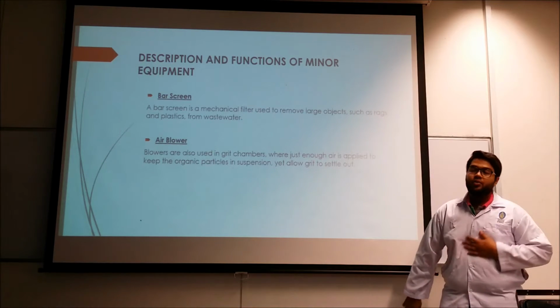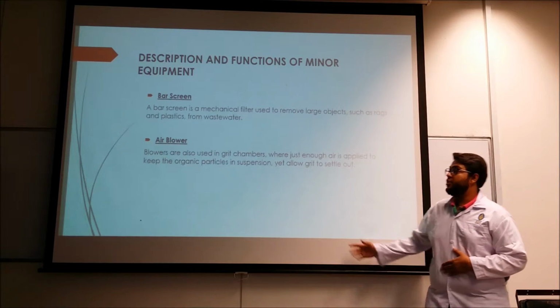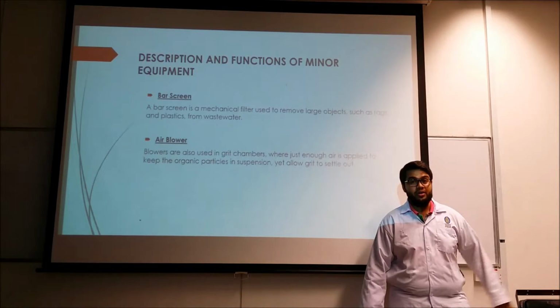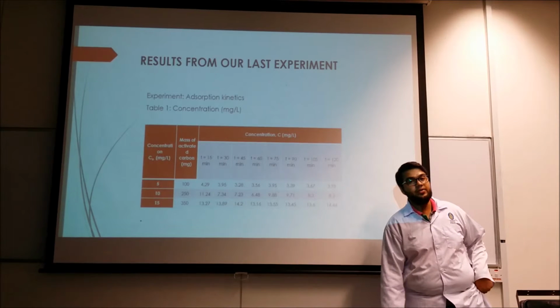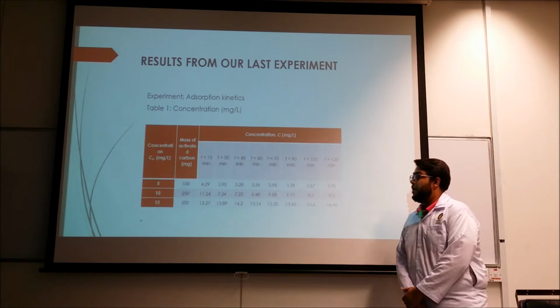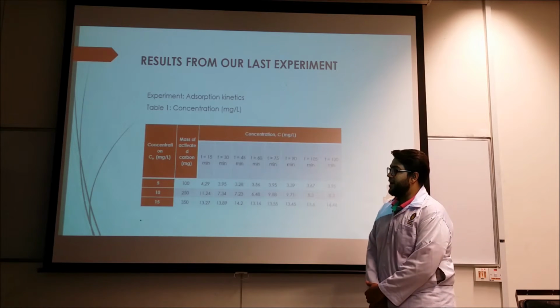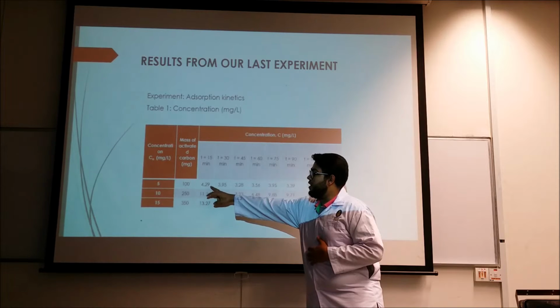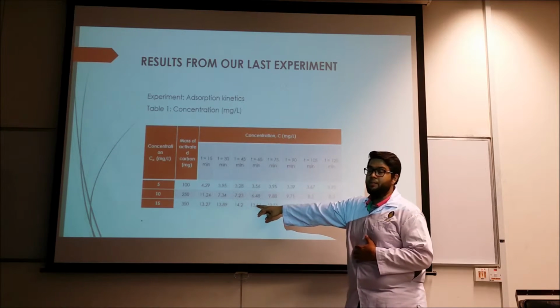Okay, now I would like to relate this equipment and description with our lab experiment. And this is the result that we have obtained. From the result we can see that we have prepared three different concentrations of methyl blue solution: 5, 10 and 15 milligrams per liter.